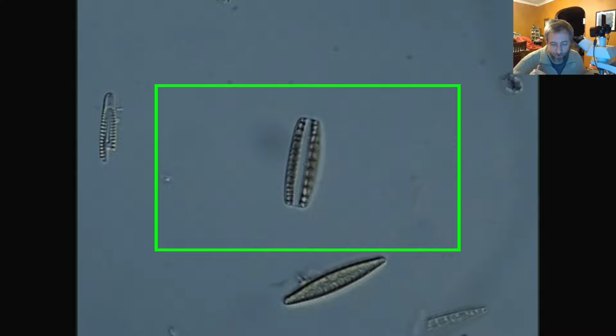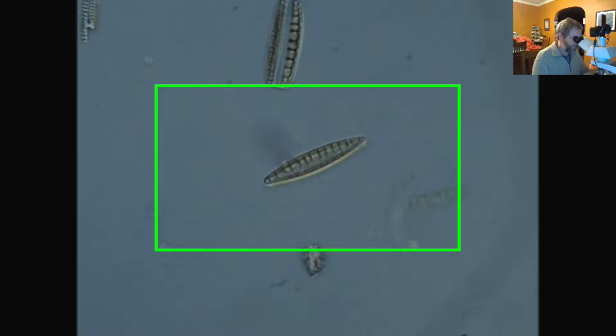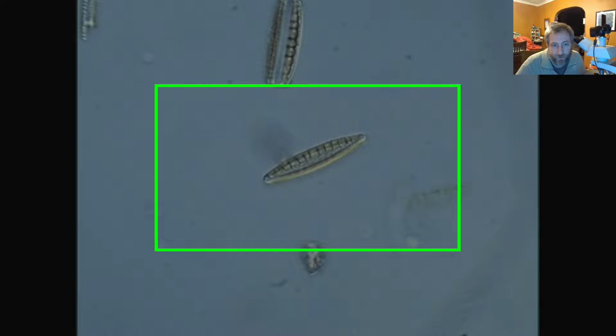One thing that becomes really neat is that because we're using a light microscope, we can actually see through the diatoms. If I use optical dissection, which is basically just having one plane of view in focus at a time and then slowly rotating my focus knob, what you'll see, especially if you look at the diatom here, I'll move that one into the center, the valve view one, is that the fibulae, those little bubble-like, teeth-shaped things, are at the top, and that is actually the bottom valve. We're looking through the entire assembly of the diatom.